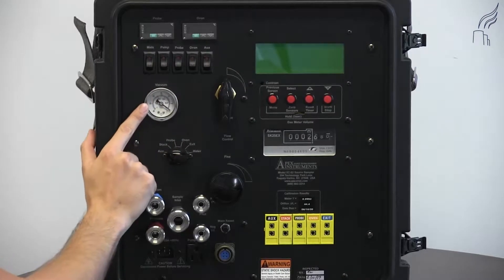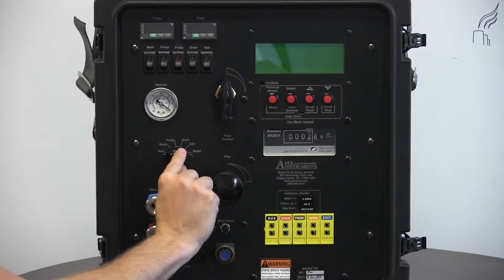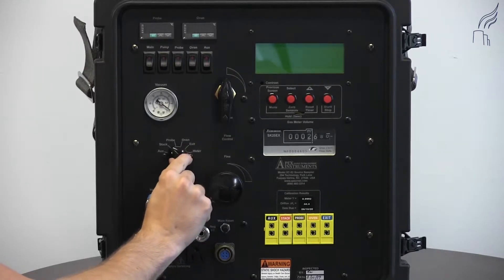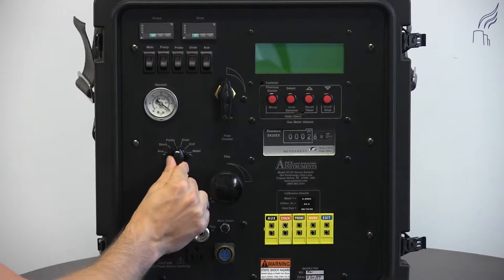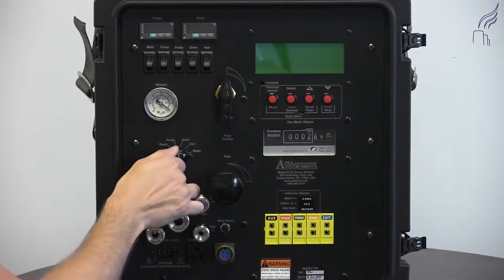Moving down, we have a vacuum gauge and our six-channel thermocouple switch. These channels include auxiliary, stack, probe, oven, exit, and meter.